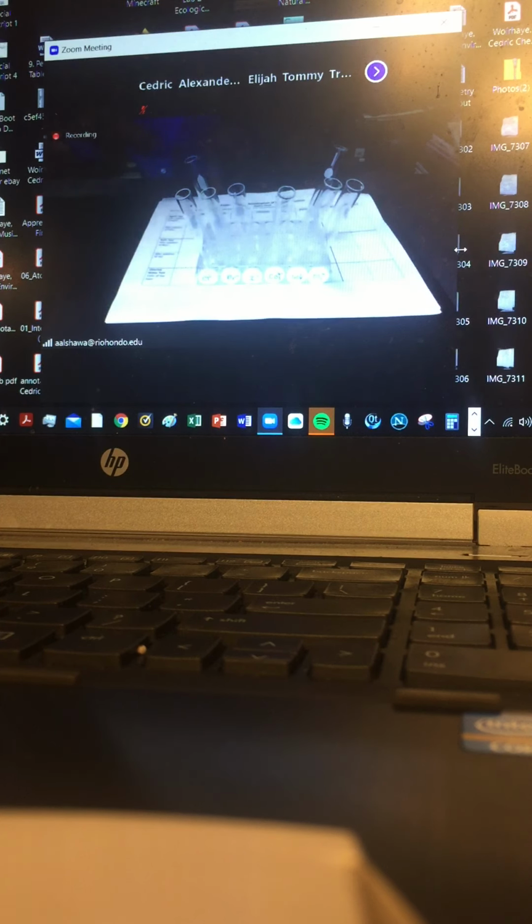All right, so now we're going to start with unknown 1. Let me just hide it for a second. So this is unknown 1. And then unknown 2.